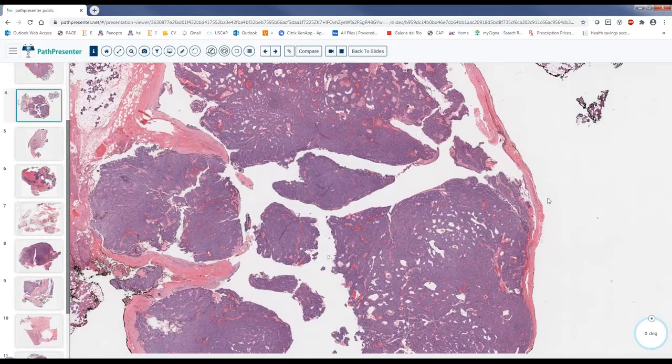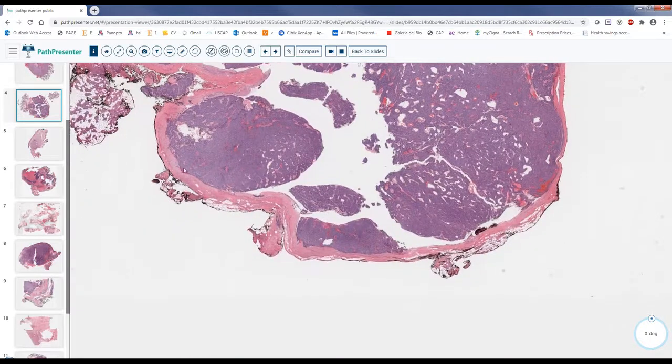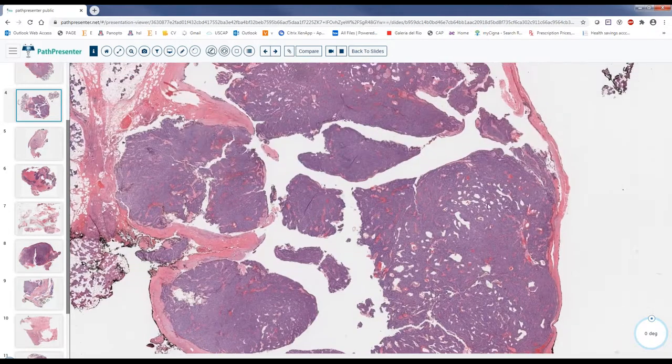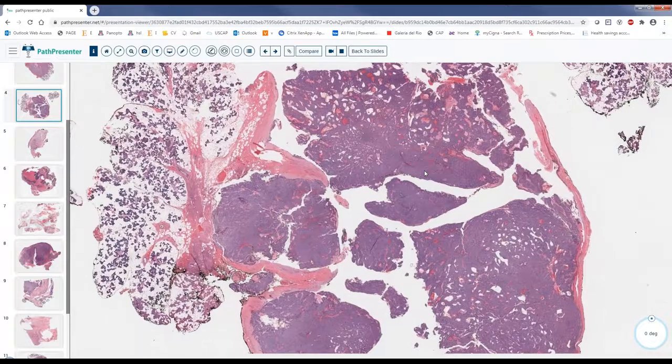If it is big, you can go around the capsule, the entire capsule of the entire lesion. Slice the whole thing every 3 millimeters, and if you don't want to give 50 slides to that tumor, give it a good 10 slides with the whole thing, and then go around and take the capsule. Okay, so you'll be comfortable with the capsule, and most of the time again it's small.